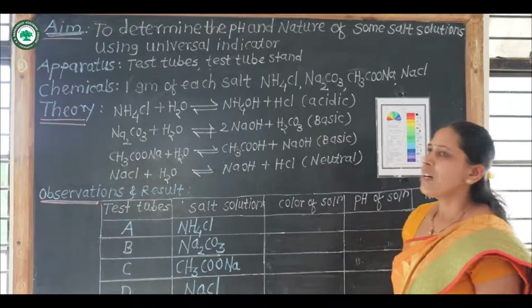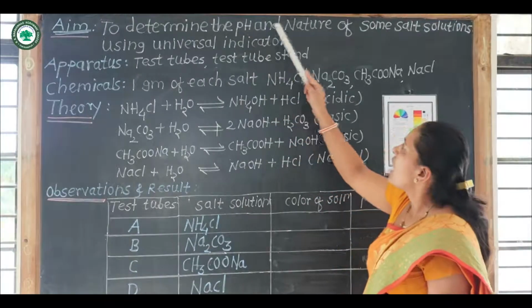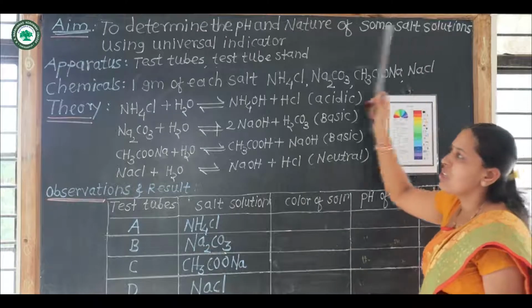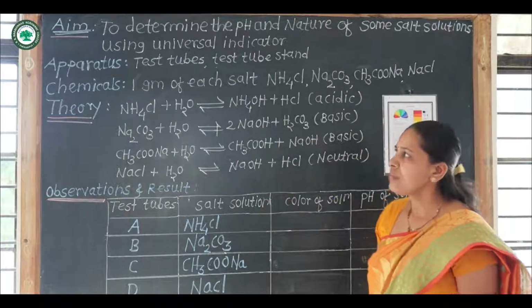The aim of our experiment is to determine the pH and nature of some salt solutions using universal indicator.